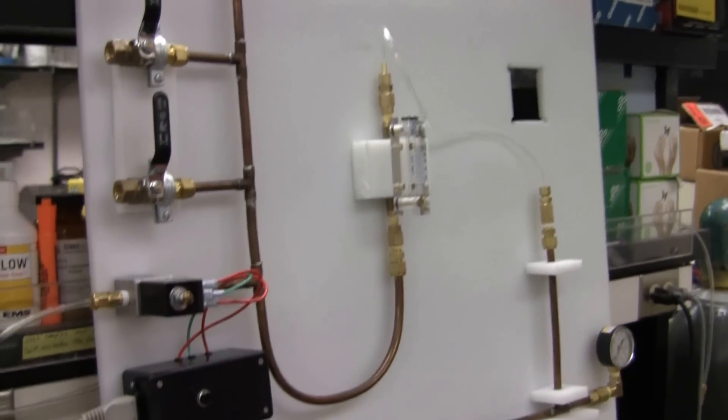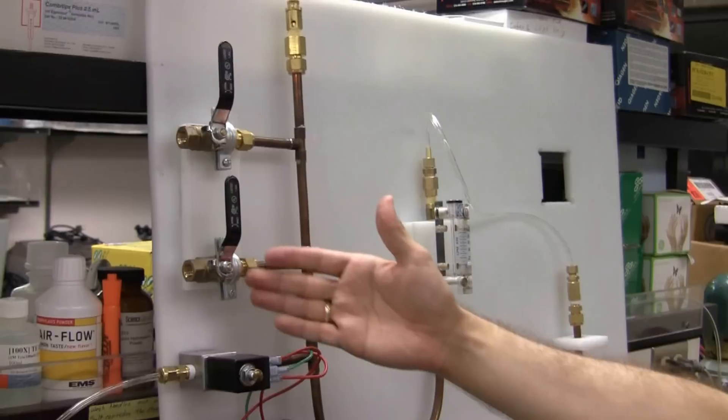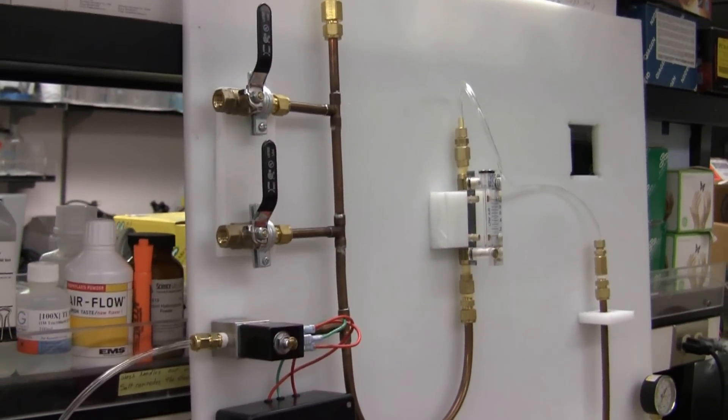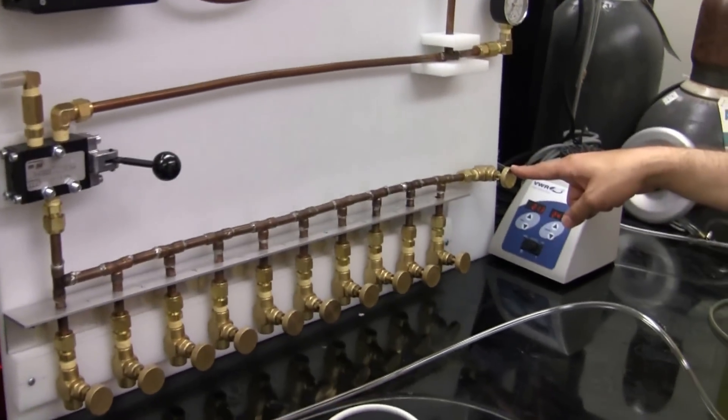As you can see, the manifold has three inputs, ten outputs, and an exhaust valve.